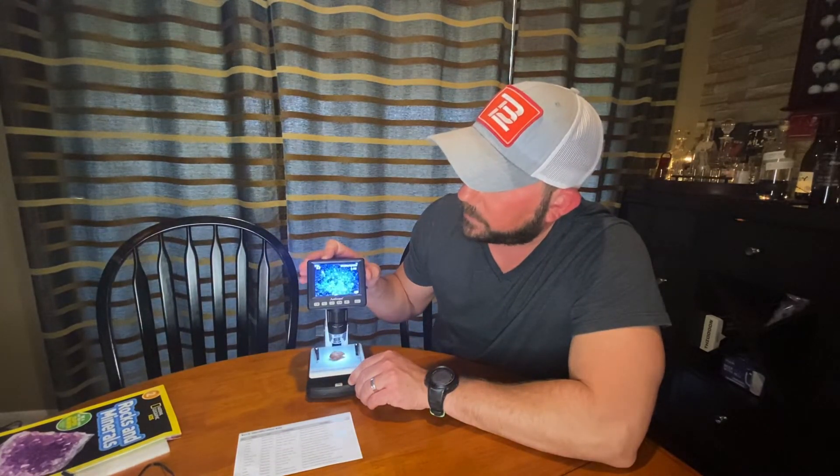You can actually adjust the lighting too — this thing just doesn't stop with options. So we hope to have this for a long time with Fallon and Palmer and the family. We'll be using this a lot and hopefully show you things from the yard or from school that Fallon may bring home — let's see what the microscope can do. I hope you enjoy the rest of the video. Thanks!